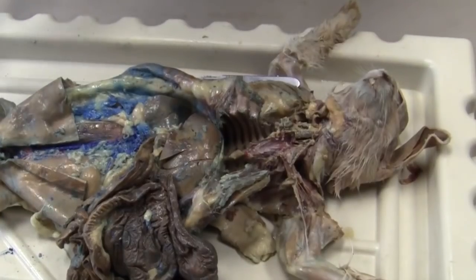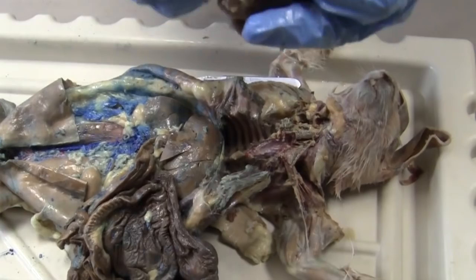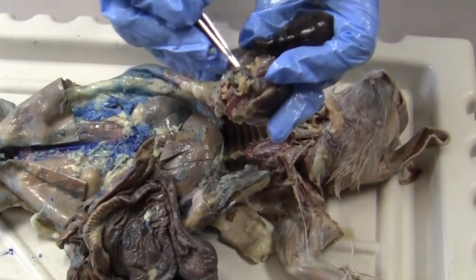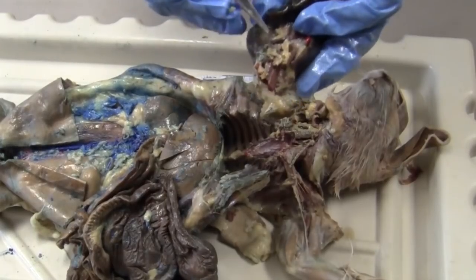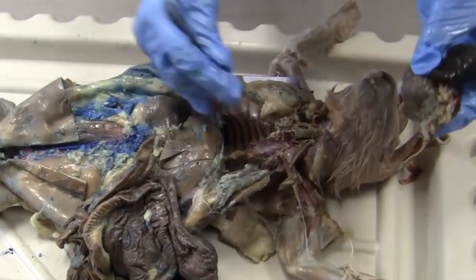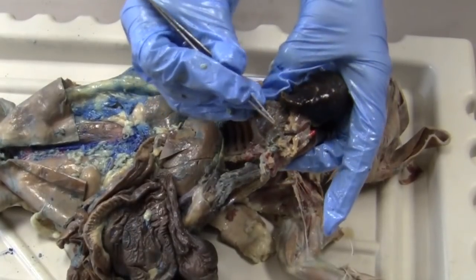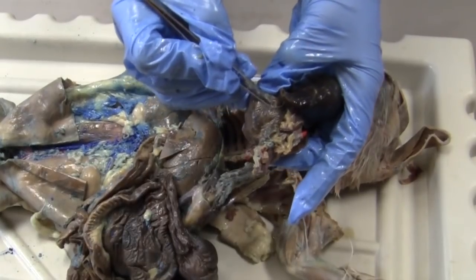So here's where I'm going to show you. Once again, I have the caudal vena cava. I have the cranial vena cava going to the bottom side. This is actually the azygos coming to the back side of the heart right here. And it comes down just the back side like this. And that is bringing blood back from the ribs and meeting into that cranial vena cava and going into the right atrium of the heart.